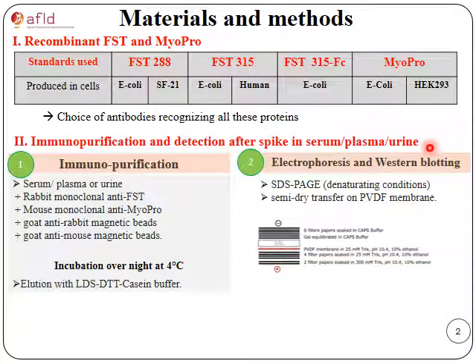Secondly, proteins are separated by sodium dodecyl sulfate polyacrylamide gel electrophoresis, and afterwards they are transferred by the semi-discontinuous system buffer onto a polyvinylidene fluoride membrane.